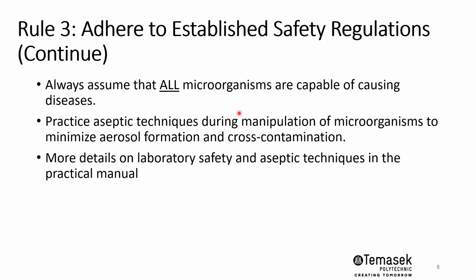Aseptic techniques will be taught during your practicals. This includes flaming of your inoculating loop, and opening your specimens in the smallest way possible, so as to minimize cross-contamination. This also includes working near a Bunsen burner flame. More details are in your laboratory manual, as well as during the practical session.